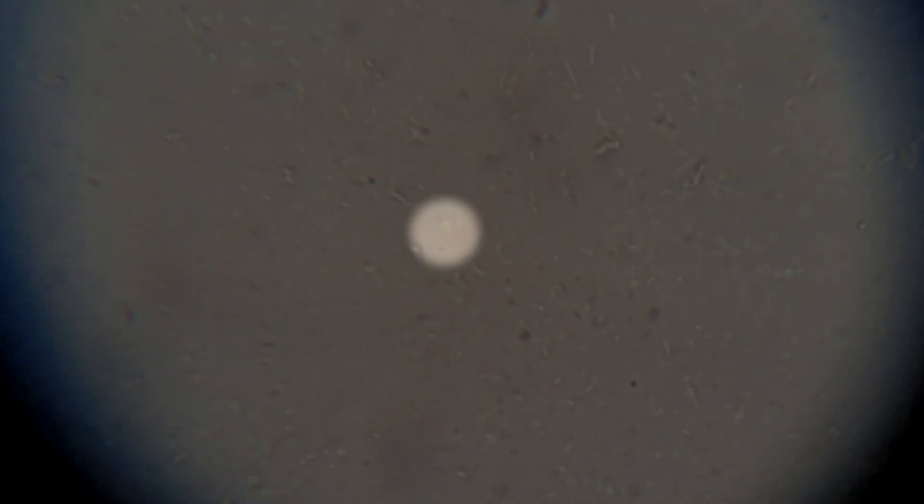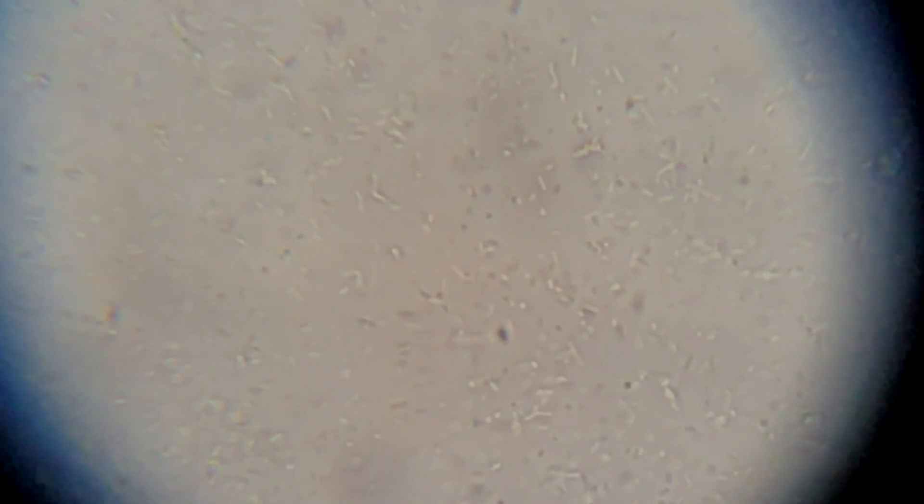And over here you are observing one of them which has damaged flagella. As a result, it is unable to move. And some of them are not moving at all.